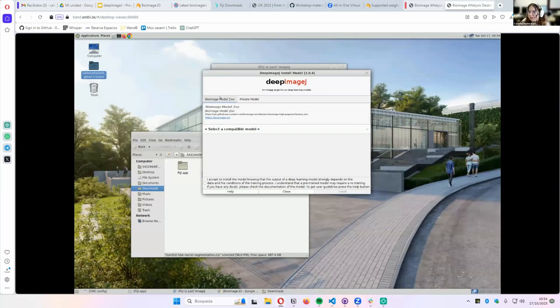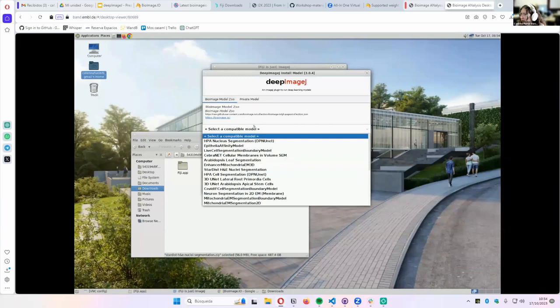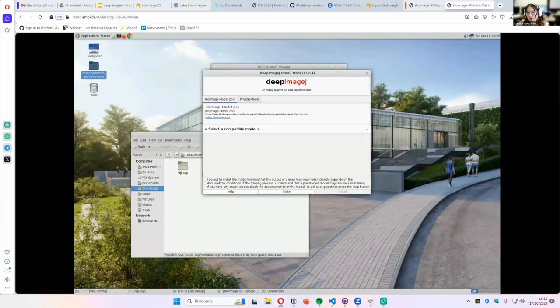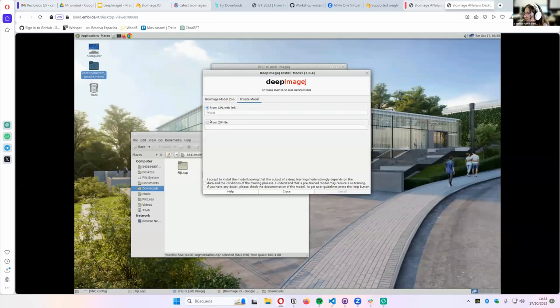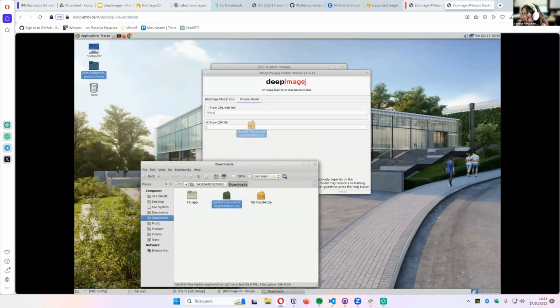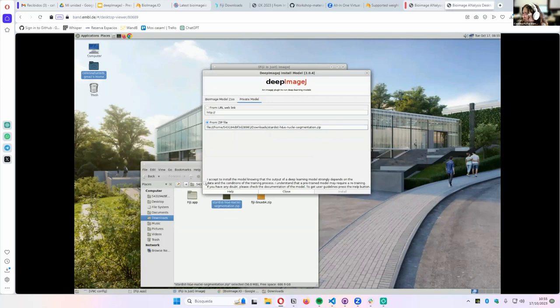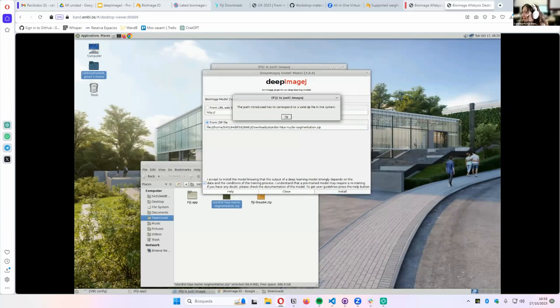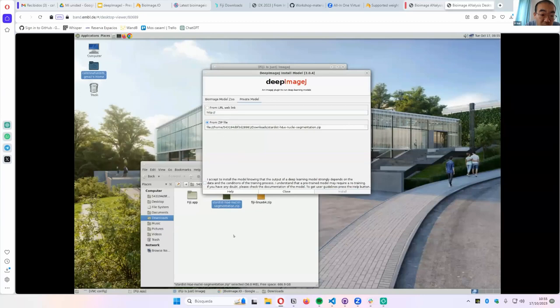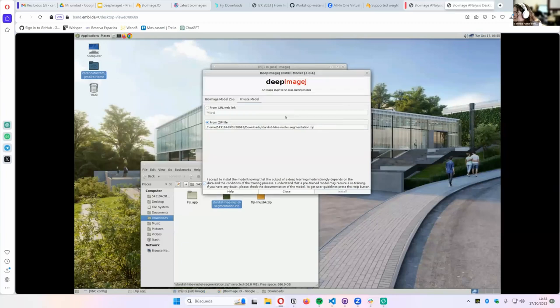You can drag and drop the zip file into the install model dialog. We accept the conditions and install. On BAND systems, if the path starts with 'file:///home', you may need to remove that prefix and start with '/nfs/home' because the home directory is an NFS mount. If there's an ampersand in the filename, it won't let you read the path — rename the file to remove it. Once models are installed, you can have multiple models and choose among them in DeepImageJ Run.